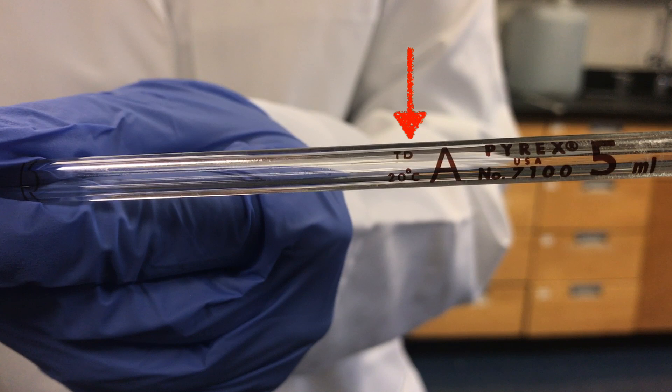Next to that it shows the letters TD which stands for to deliver, which means this pipette will deliver 5 milliliters plus or minus the standard error. Even if there is still a small amount of liquid left at the tip, it's all accounted for.